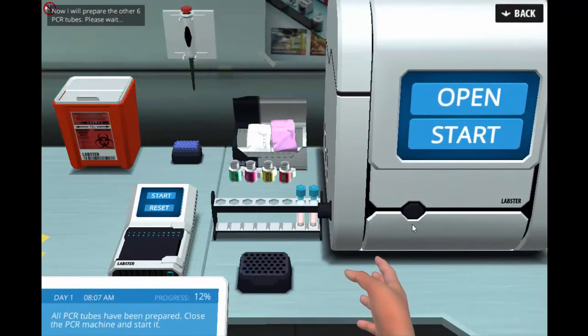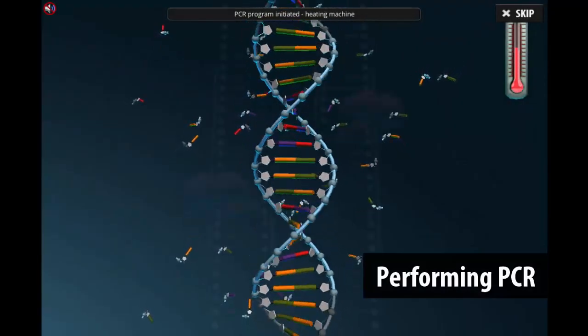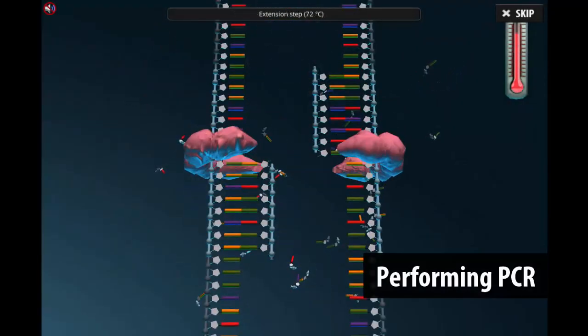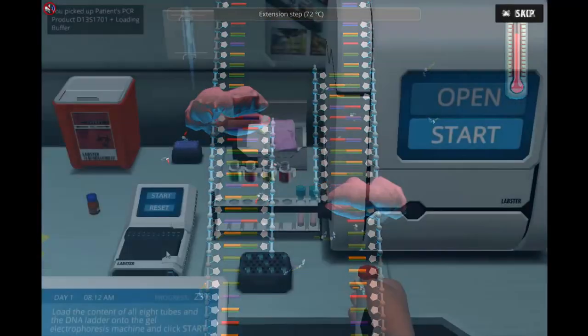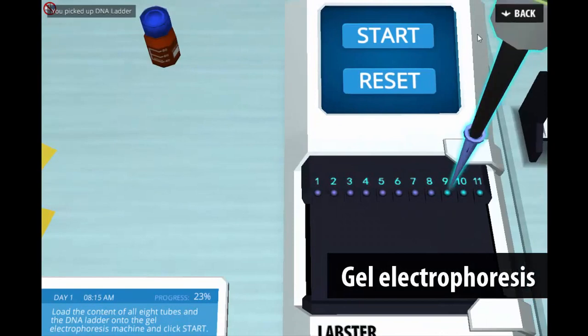Students perform PCR to amplify the microsatellite markers and analyze their genotype using gel electrophoresis.